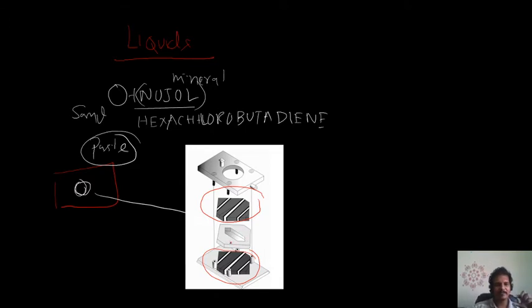ஓகே, உங்கள் சாண்ட்விச்சில் நடுவில் வெஜ் அண்ட் சிக்கன் பீஸ் இருக்க மாதிரி நடுவில் இந்த பிளேட்டில் மினரல் ஆயில் இருக்கும். மினரல் ஆயில் சாம்பிள் கூட மிக்ஸ் பண்ணது. On either side you have a plate, like bread. It's like your bread, you have your sodium chloride or your potassium bromide, either sodium chloride or potassium bromide, any one it is. ஸோ இது மூணுத்தையும் ஒன்றா சேர்த்து it will be kept in the path of the light.